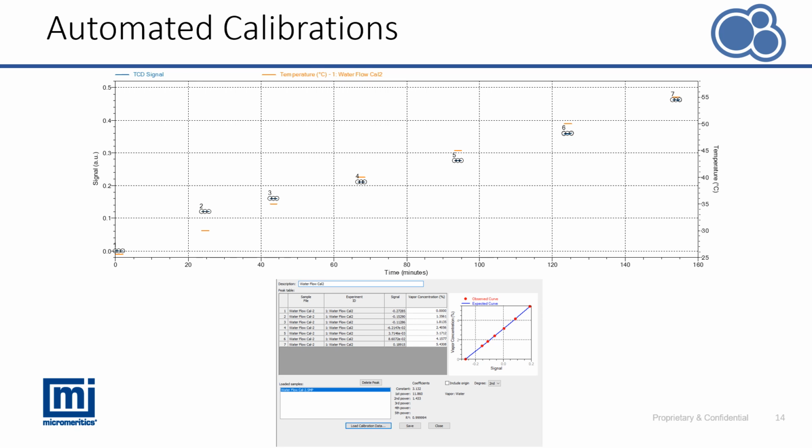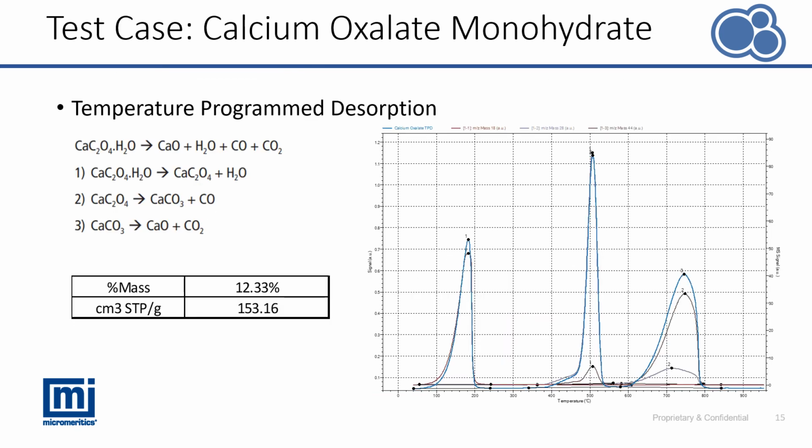In our example later, the quantities given off during the experiment would lie within this calibration curve. For results that are being quantified and lie within the calibration window, a second order fit is recommended. The calibration of signal is not always required, but it is useful for quantitative comparisons or if those determinations are needed. An example of using this calibration with a real sample can be done by using calcium oxalate monohydrate.